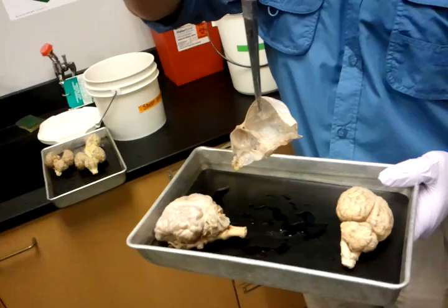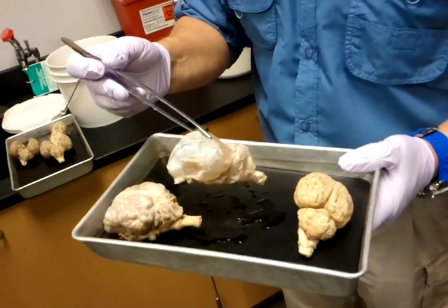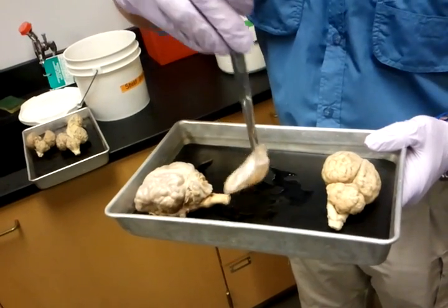All right. This is just coming off the left side. The outer thick white part is the dura. There's just no getting around it. But you have to say what? Dura, or do you have to say dura mater? Dura mater. No, you have to spell it out. You can't just put dura. We got different divisions coming through.